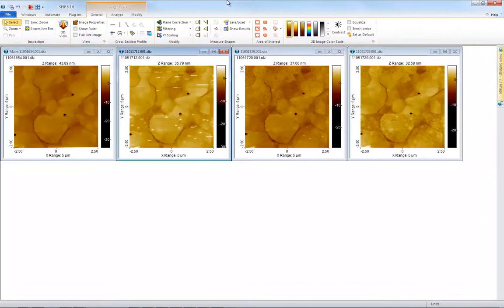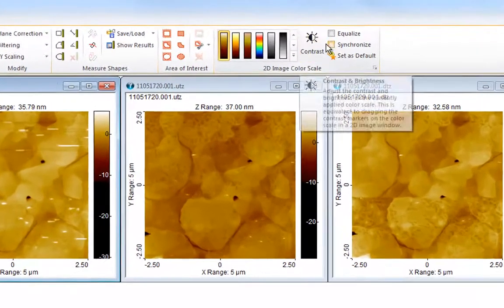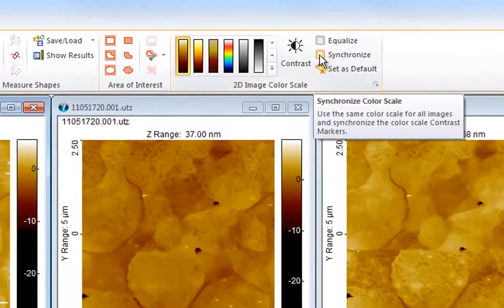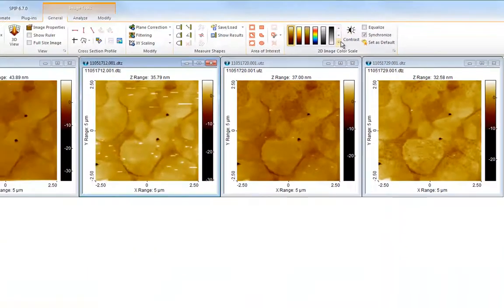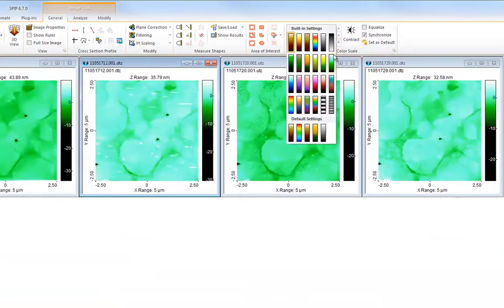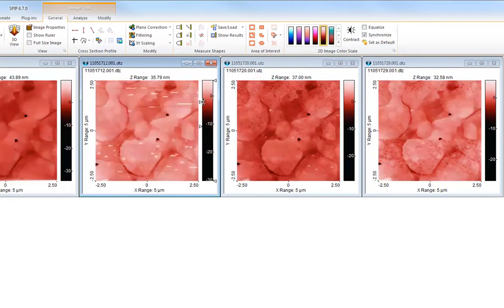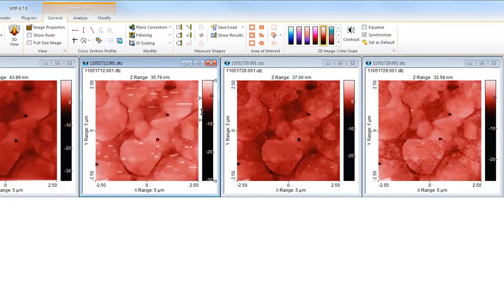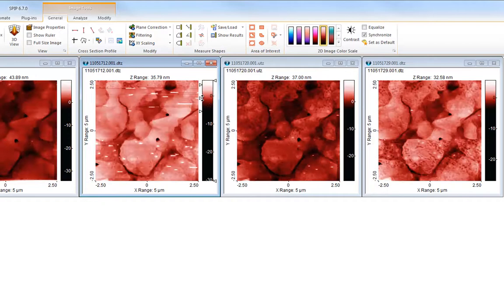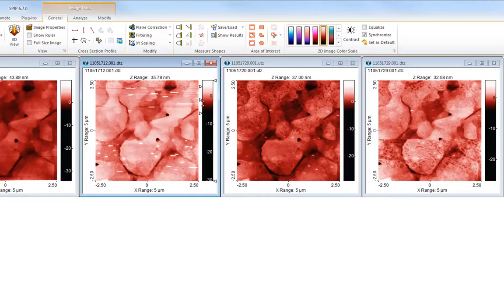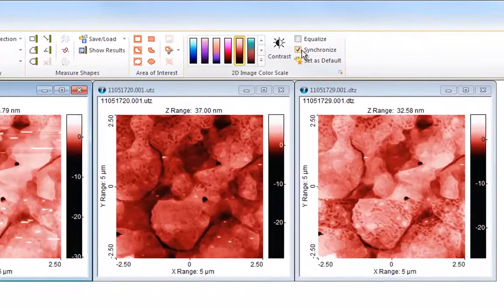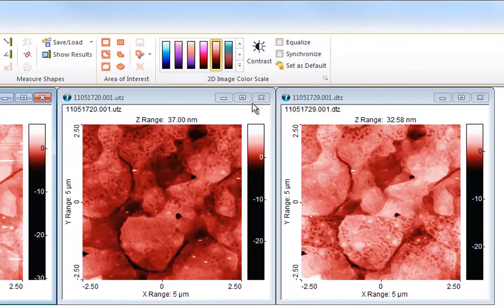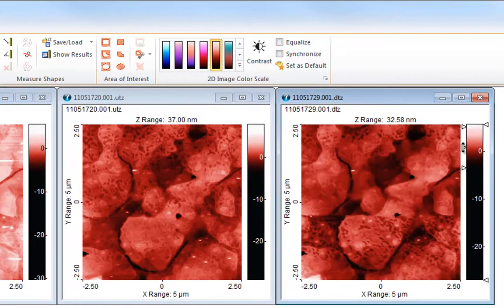Sometimes we want to change the color scale for all open images. And this is easy. Simply enable the color scale synchronize option. You can now even adjust the contrast for all images at the same time. If you want to adjust contrast and brightness individually for each image then disable the synchronize option again. The chosen color scales will stay.